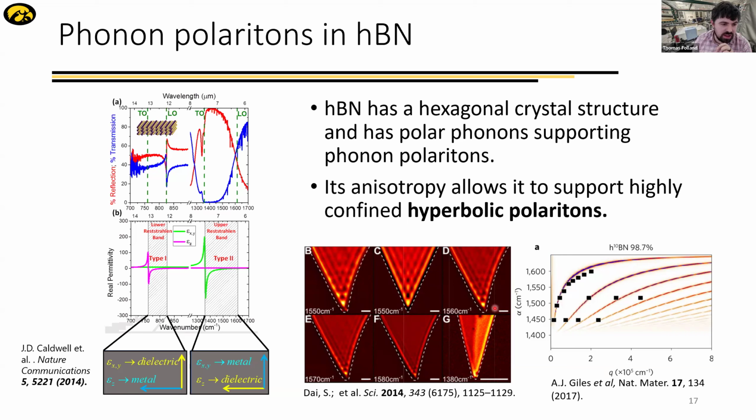So to give a sense of scale here, the scale bar numbers dropped off, but if I remember correctly, this is about 2 microns, and the fringes observed experimentally can be as small as 100 nanometers. So you really have something with kind of 6 micron wavelength, 7 micron wavelength, but in free space. But in boron nitride, the wavelength is on the order of a couple of 100 nanometers.